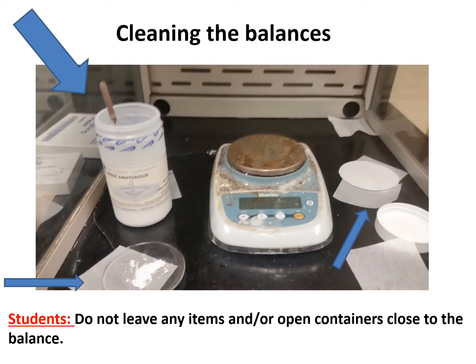Here's another problem. Chemicals open next to a scale in a scale hood, completely unattended. Can't have that. You can't have chemical sitting in little watch glasses or weighing dishes just sitting around. No one knows what they are. Even though that chemical container's there, that white powder at the bottom could be something else. You have no idea. So you never leave anything opened to the air.